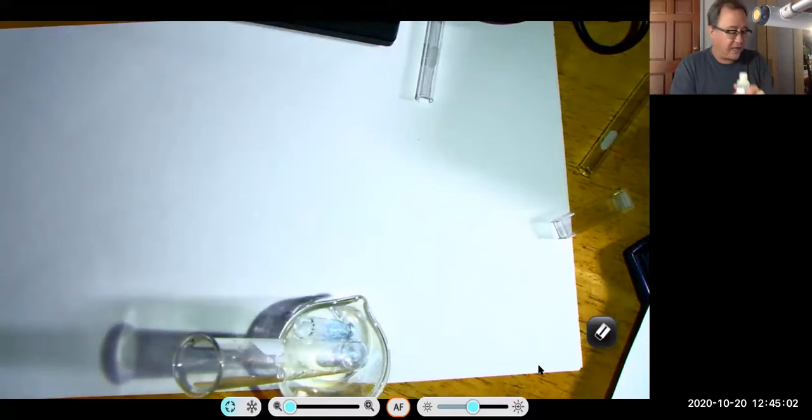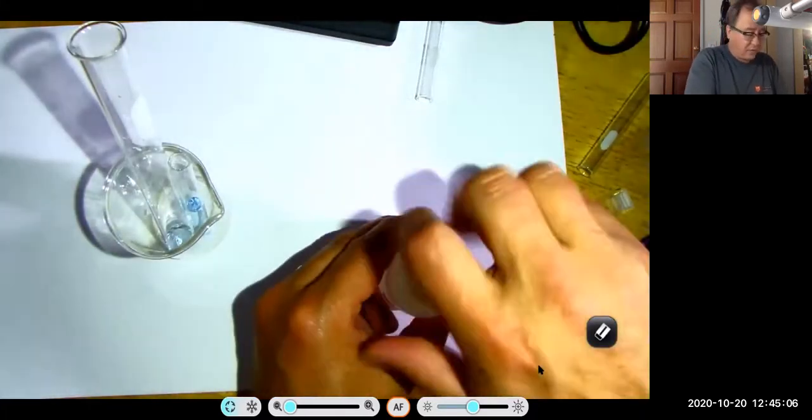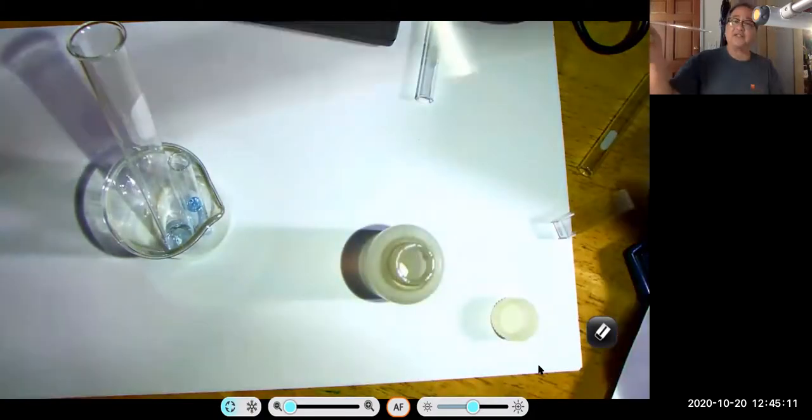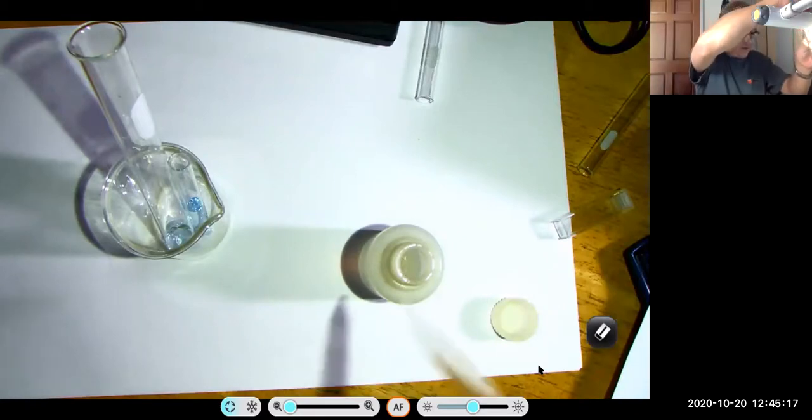Okay, that's good. Now what I'm going to do is take the diluting solution and use precisely 1 milliliter also. So I make a twofold dilution. So with this one, I don't need to do any rinsing because I can just use the same pipette I had before.